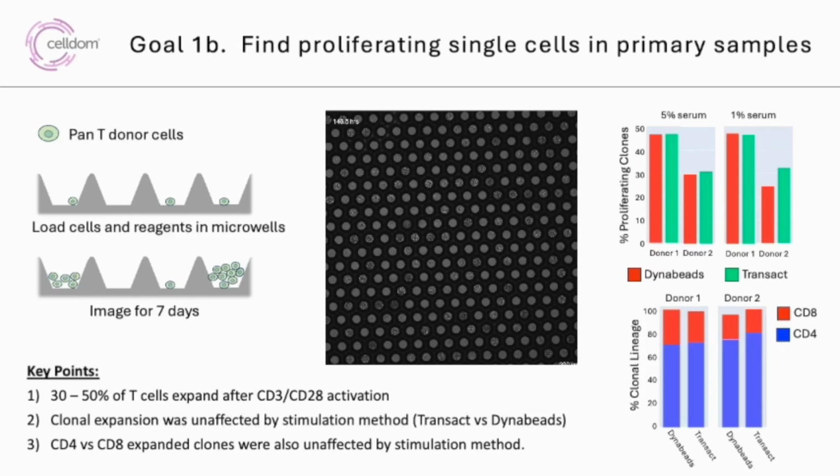Specifically, here we compared Thermo Fisher Dynabeads and Miltenyi Transact CD3-CD28 T-cell stimulation reagents. And we found little difference in the clonal structure of the expanding clones based on these two different activation media. So it is just not true that every cell will expand.